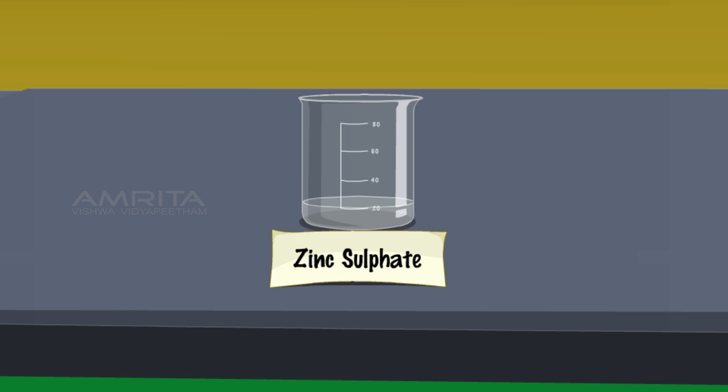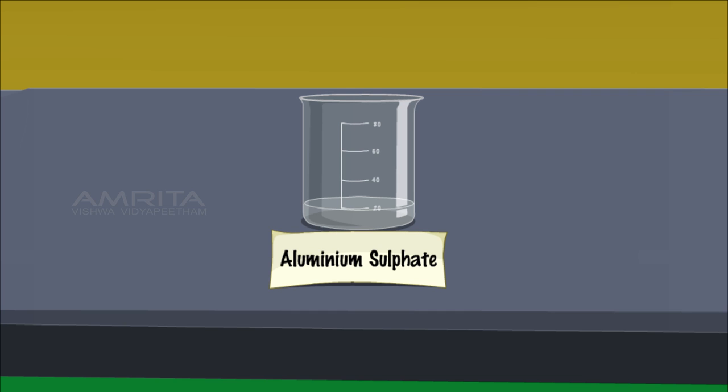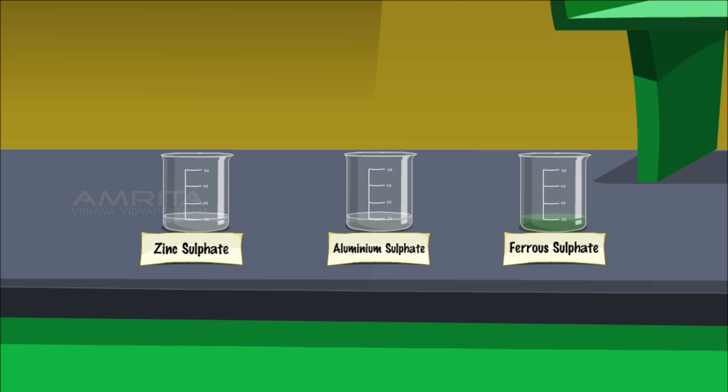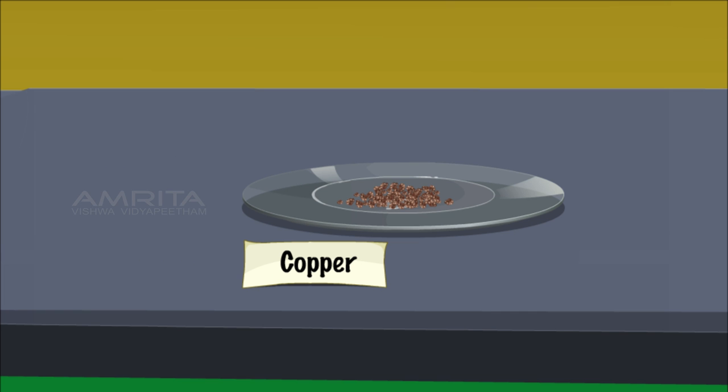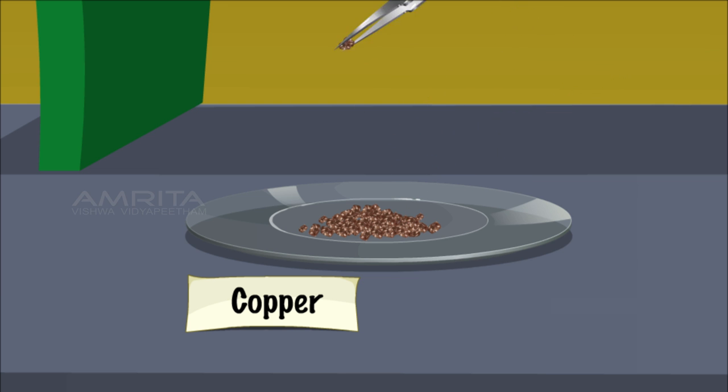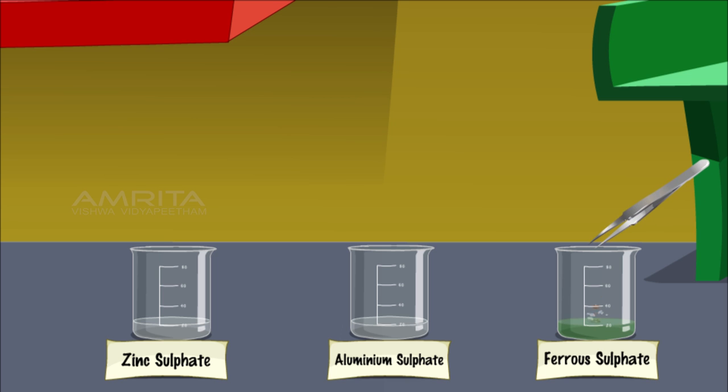Copper. Take about 20 ml of zinc sulphate, aluminium sulphate and ferrous sulphate solutions in three different beakers, and some copper metal pieces in a watch glass. Using a forceps, add two pieces of copper into the beakers containing ferrous sulphate, aluminium sulphate and zinc sulphate solutions.